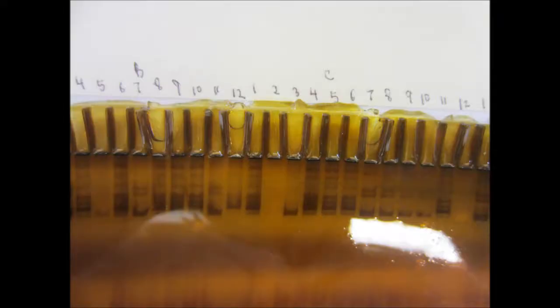The bands on the gel can finally be assessed where hybrid progenies should contain both bands coming from each parent.